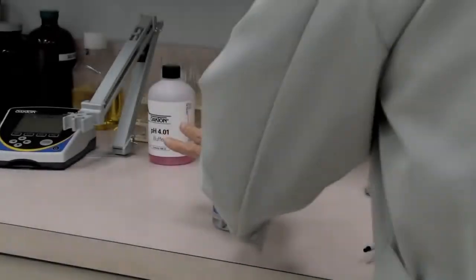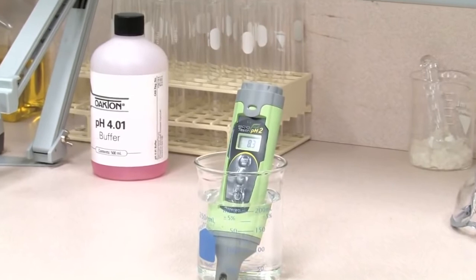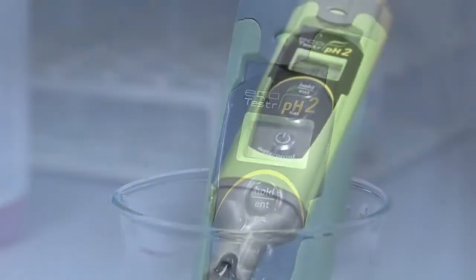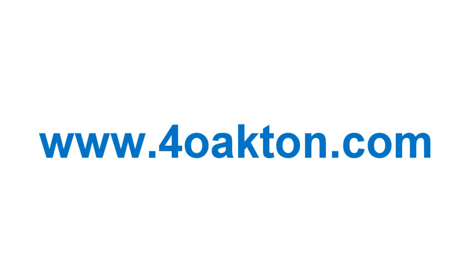The Oakton Waterproof EcoTester Pocket pH Meter — an economical choice from Oakton, your source for accuracy, quality, and reliability for more than 20 years. Check out all of the Oakton Waterproof testers at 4oakton.com.